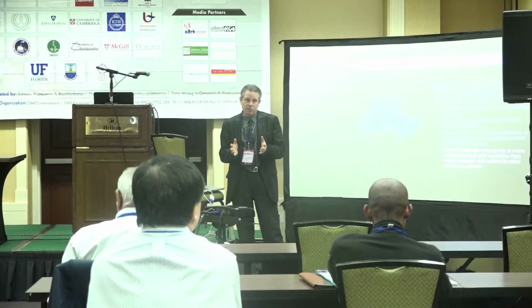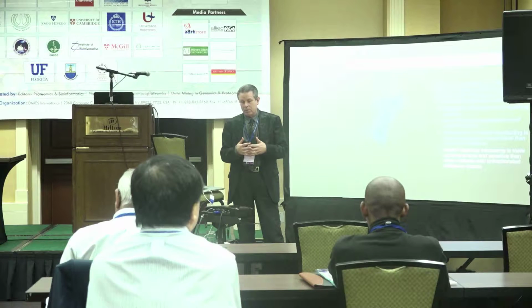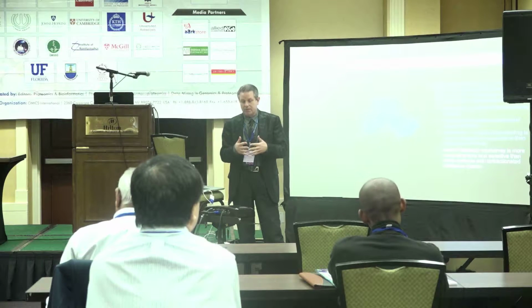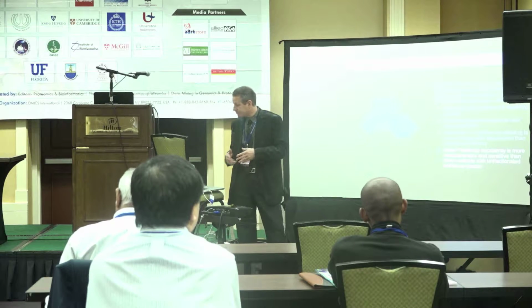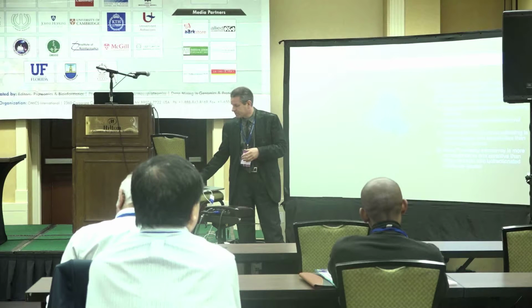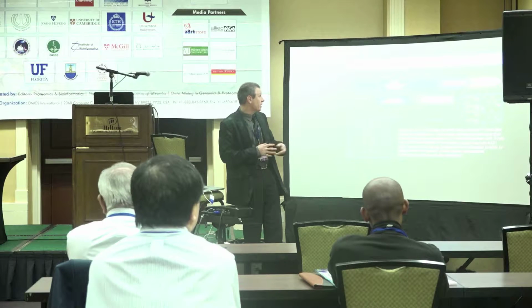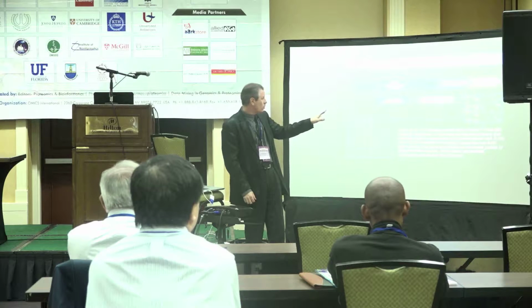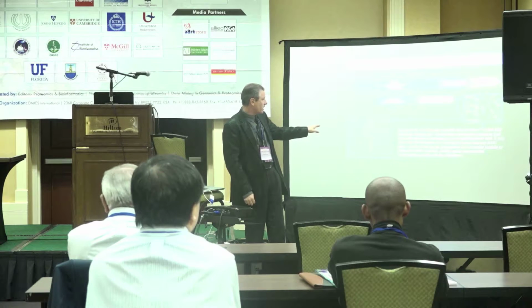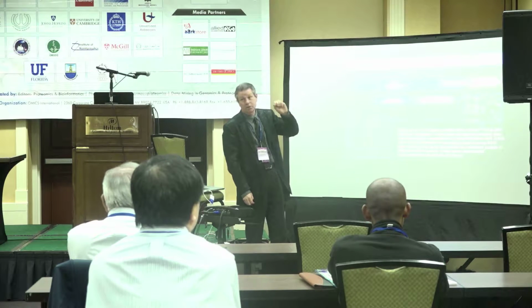But the microarray is where we can look at large numbers of samples, where we can investigate at this point about 878 antibodies at a time on a microarray platform. And that's what I'm going to be presenting. So this antibody microarray is one of various services that we have. And this is actually an image of a CAM880 chip. This was the predecessor of the chips which are now just being released from Conexus.